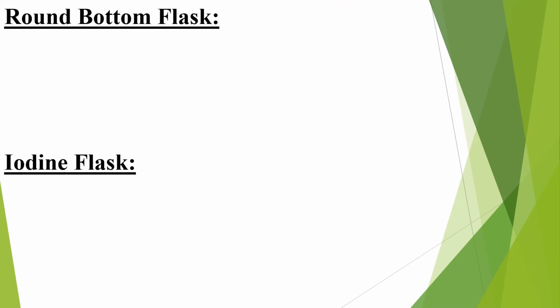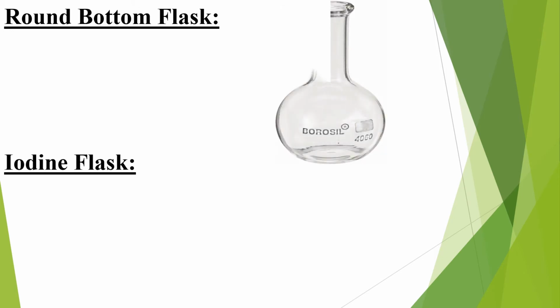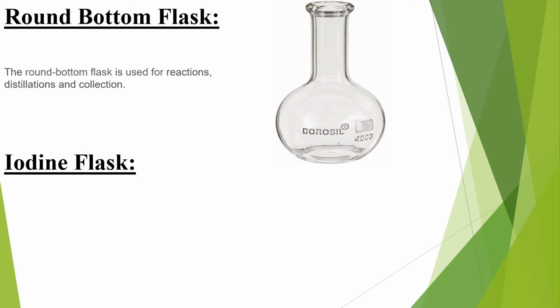Next, round bottom flask. This is round bottom flask. This is also known as RBF. The round bottom flask is used for reaction, distillations and collection.